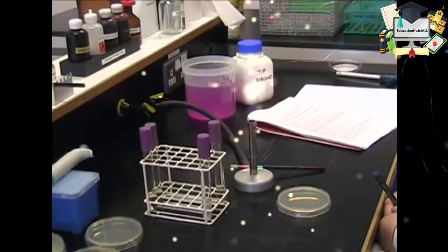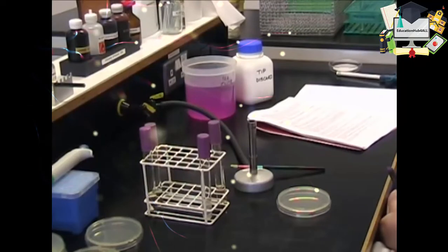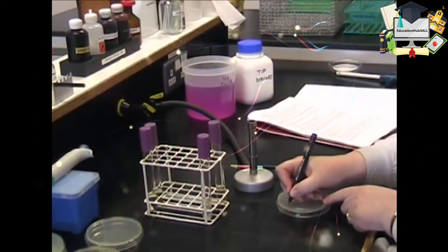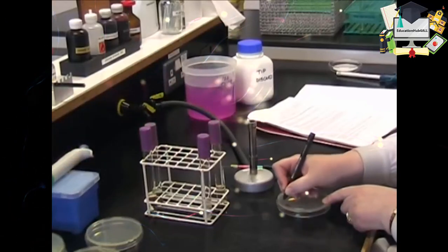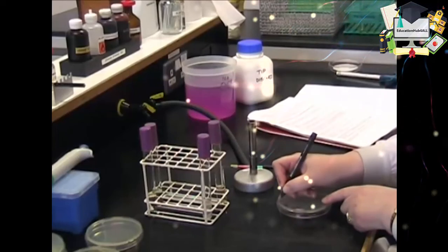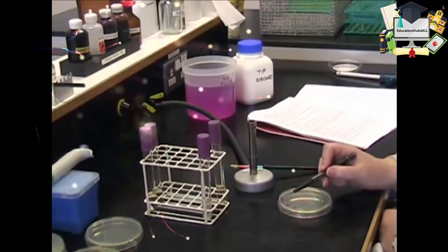When you've finished inoculating your plates or tubes, it's important to remember that you label them. Label in small writing around the edge of the plate so that you can actually see what's growing on the plate. Label with your initials, the type of media if appropriate, and the date. You should always write on the agar side of the plate.